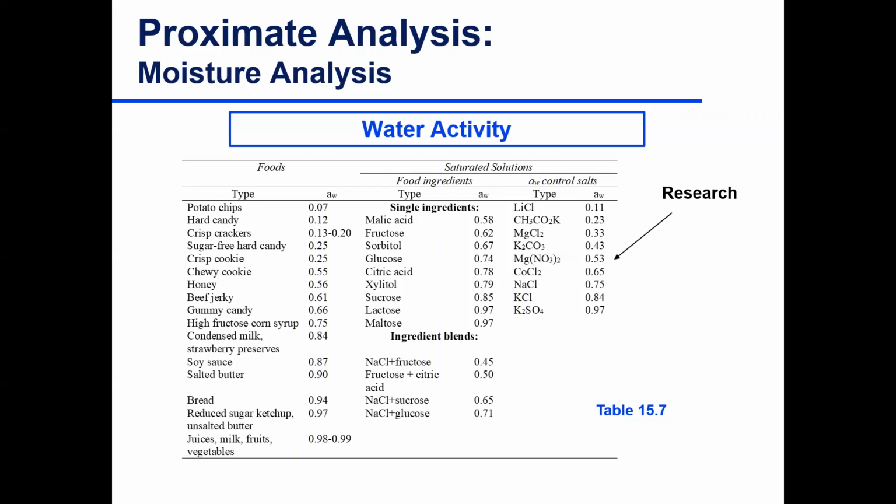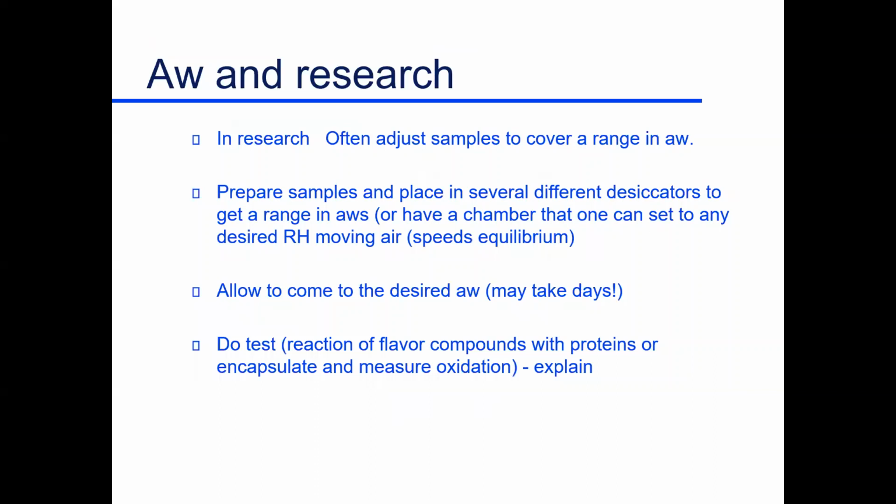And so this whole idea of understanding these reactions with the water activity, we run experiments all the time. Why could this be a problem? Could this reaction be a problem of the protein and sugar here, here, here, here? Having the ability to set up samples at different humidities, come to equilibrium, gives you a good way to do research that's really needed in the industry.